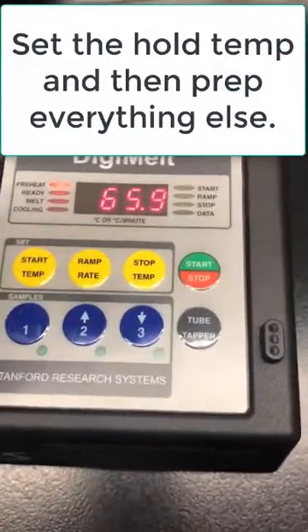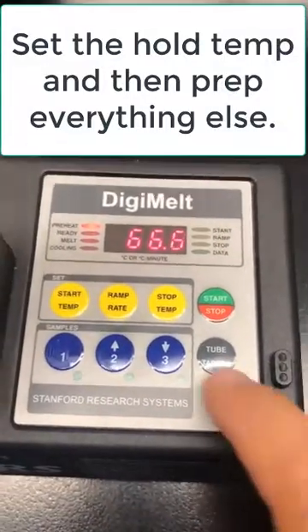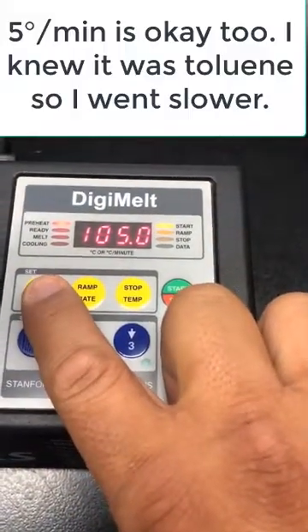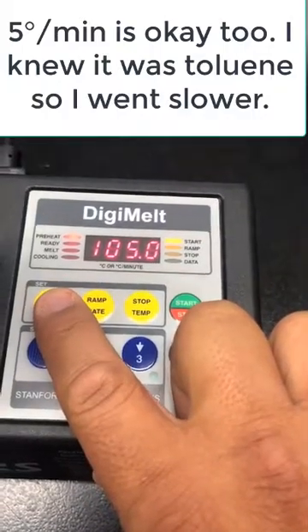Just like a melting point, I had to set a temperature, and so I'll do a ramp rate of 2. My start temperature is 105 because I know it's toluene. I know it's 111.